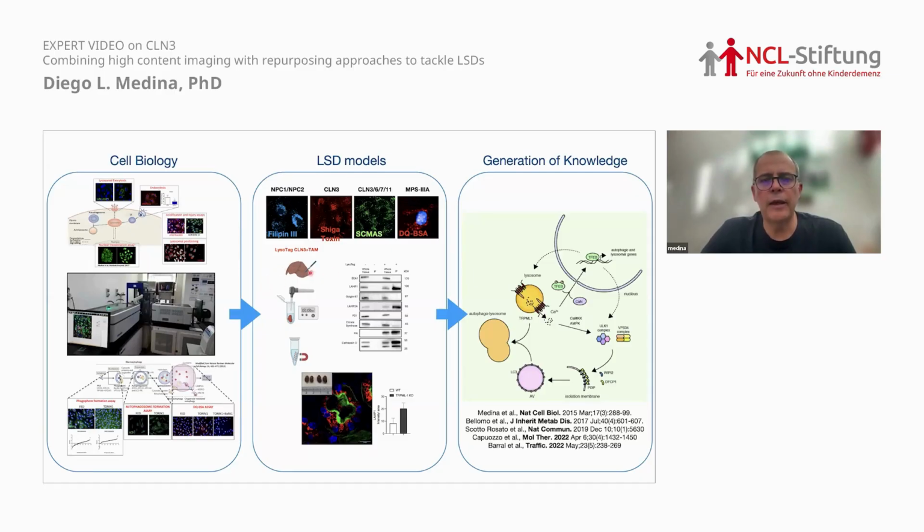This technology allows us to isolate the lysosome, and you can see in the immunoblot that we can enrich for lysosomal proteins like LAMP1, LAMP2, and some hydrolases such as cathepsin D in the fraction of the lysosomal immunoprecipitation and compare with the input or the whole tissue. This allows us to identify specific substrates that accumulate in the lysosome of disease models of different lysosomal storage disorders.